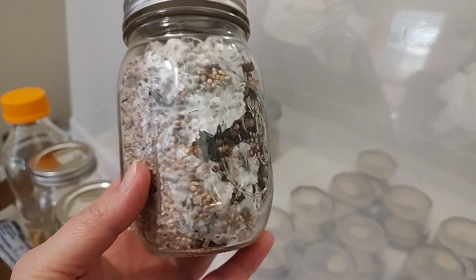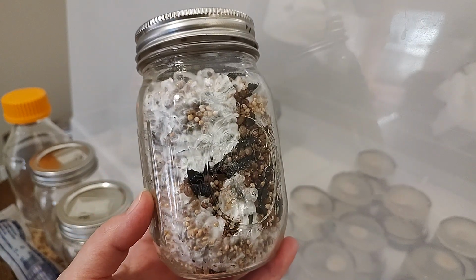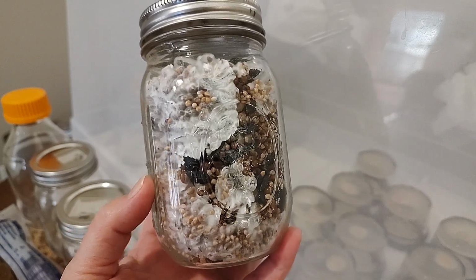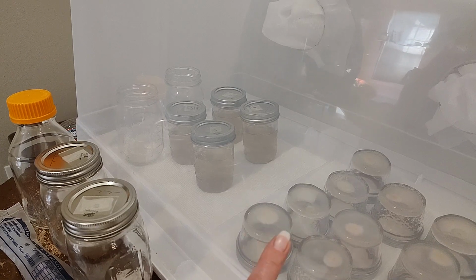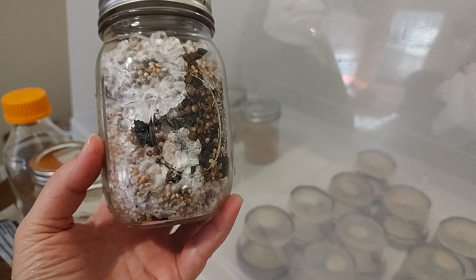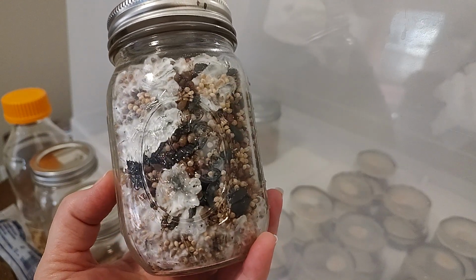However, when you're working with spores, it has to go through the germination, then to this colonization here where you actually have mycelium. When you're working with agar, liquid cultures or slurries, you're working with mycelium. So here in these agar dishes in my SAB, the still air box, this is mycelium. No spores going on here. No spores. When you're working directly with the mycelium and not the spores, you're working with more mature fruits.